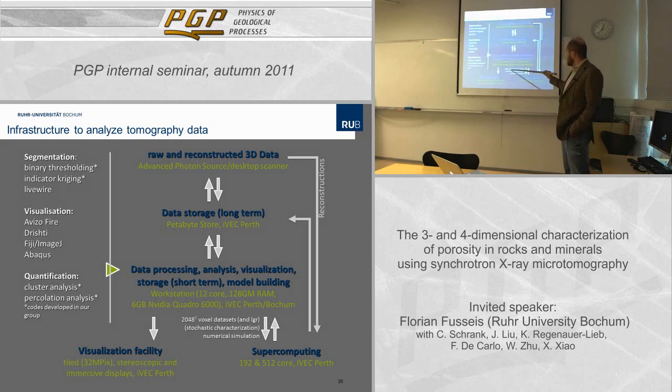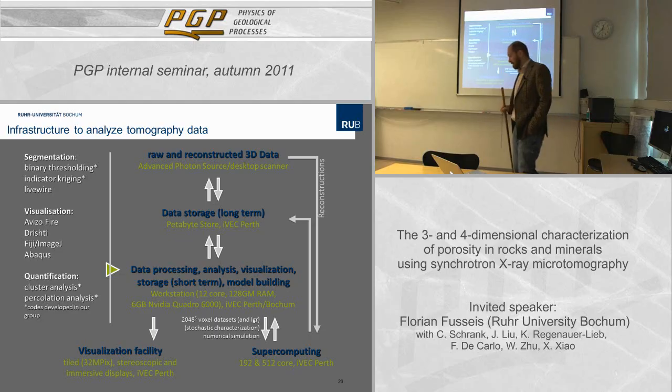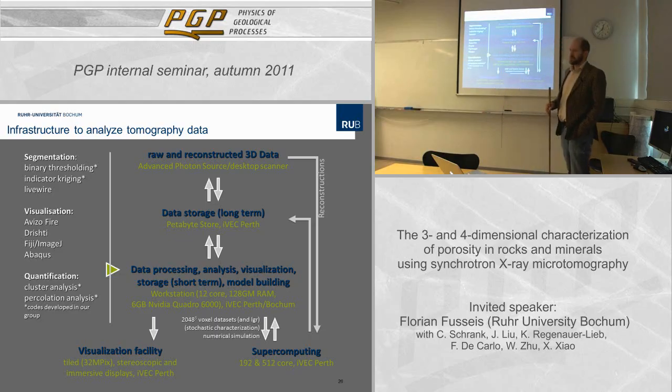What is important, though, is the dimension of the data sets that you can quantify, and that is a bottleneck of most of the commercial software packages, because they either need you to coarsen your data artificially or just make smaller volumes. That is why we have invested. We were lucky that we had this connection to a supercomputing institute, which allowed us to outsource all of the calculations onto 2 supercomputers. That has been shut down last week, but there is a replacement machine, which is more powerful.